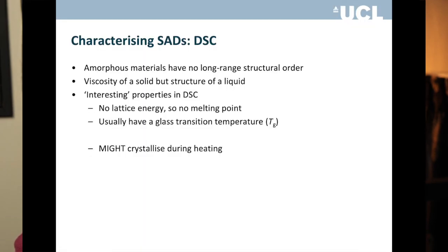Possibly the most important technique that we use is differential scanning calorimetry. And I say that not because I love calorimetry and think it's the answer to everything, it's because DSC measures phase changes. And if you're following what I said from the start, amorphous solid dispersions are really characterised by phases. We had either a solid suspension, which was 2 phase, or a solid solution, which was 1 phase. Since the DSC is capable of measuring phases, instantly it should tell you the difference between a solid suspension and a solid solution, because it's measuring the number of phases. It's relatively as simple as that.